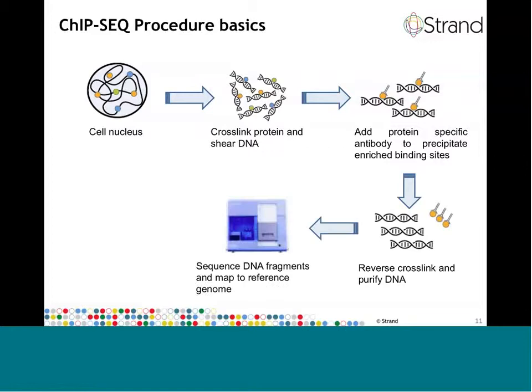The fragments are subsequently subjected to the NGS library creation steps and sequencing procedures, and the reads can then be mapped to the reference genome. The resulting aligned data can then be analyzed in Avadis NGS.